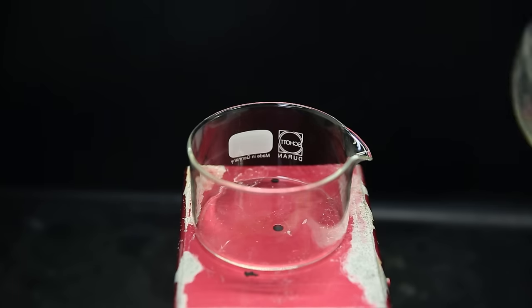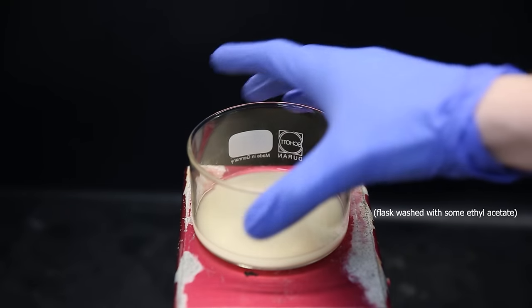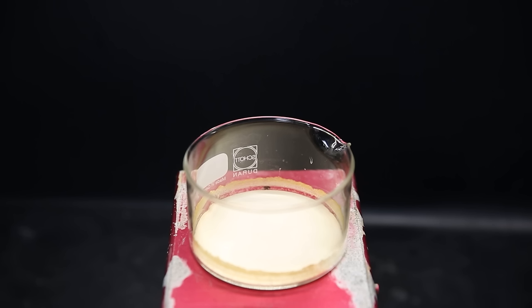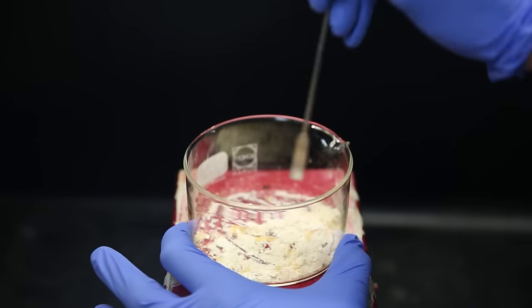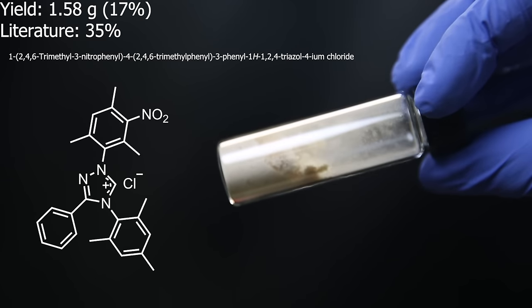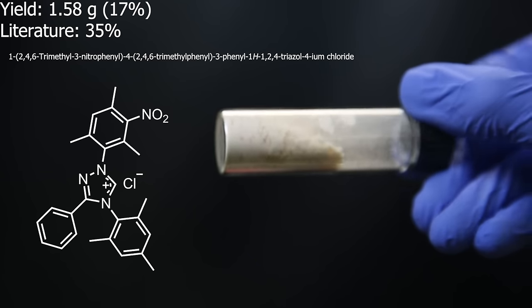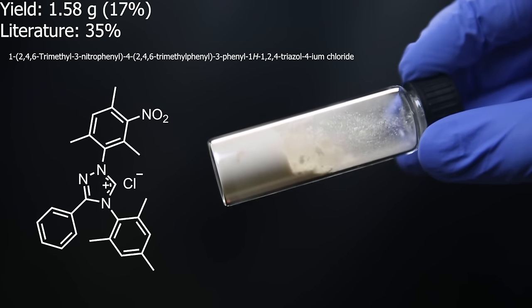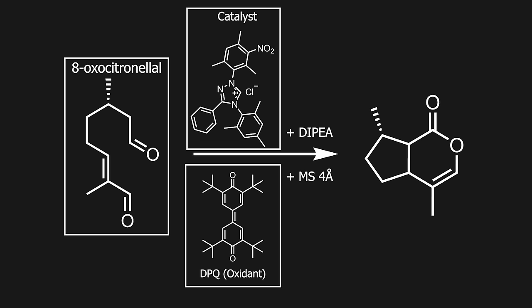After the last trituration, I pour all of it into a crystallizing dish and set it in the oven to remove all of the remaining ethyl acetate. Afterward, I am left with a cream-colored solid, with some crusty bits, and the yield turned out to be 1.58 grams, which is 17%. This is about half compared to literature, which might be because I added twice as much N-methylmorpholine before, and the fact that for the weight calculation of the added imidyl chloride, I assumed it was pure. Anyhow, it will be enough to catalyze the reaction, to make nepetalactone.